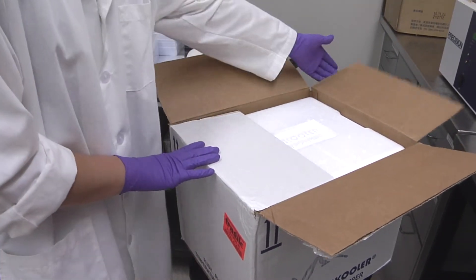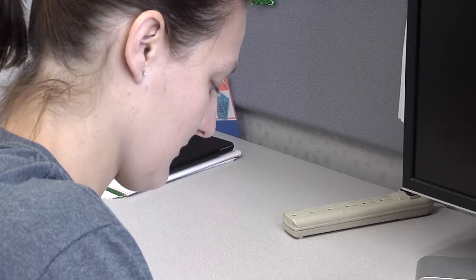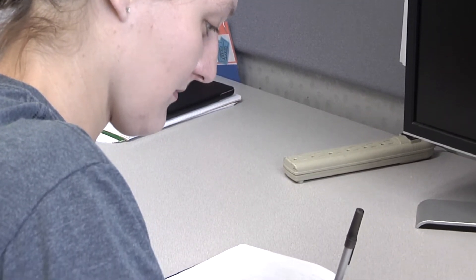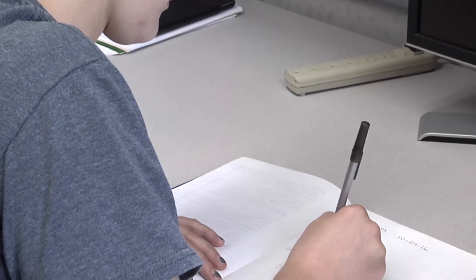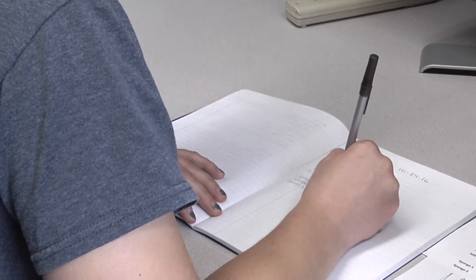It is best to have a sampling plan so that areas can be designated and then tracked. Record the results and take corrective action as needed.